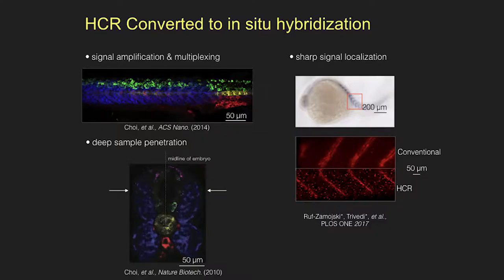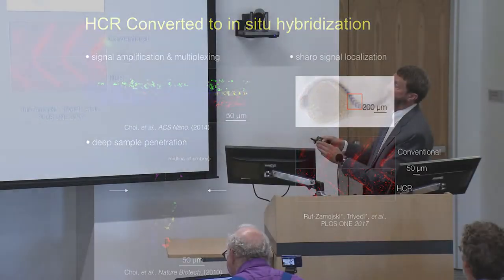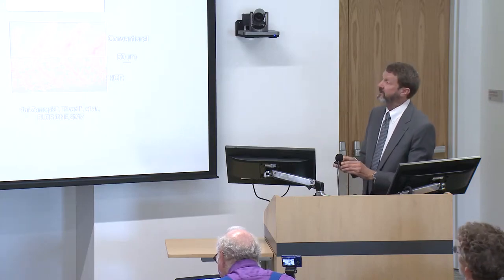The good thing about this is that the active species is very small, it's very sequence specific, and it penetrates into preparations in a quantitative fashion. It also gives us a linear gain, so the things that are lost in a normal in situ, like the nascent transcripts inside the nucleus, because they're orders of magnitude less intense than what's in the tissue as a whole, in conventional in situs they disappear, in HCR they show up quantitatively just as they should.